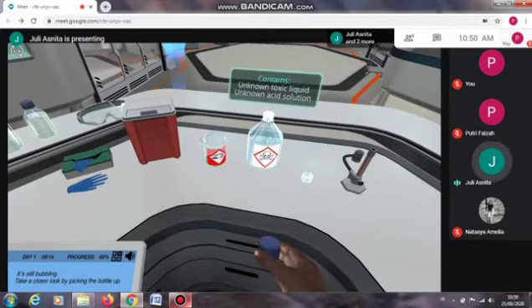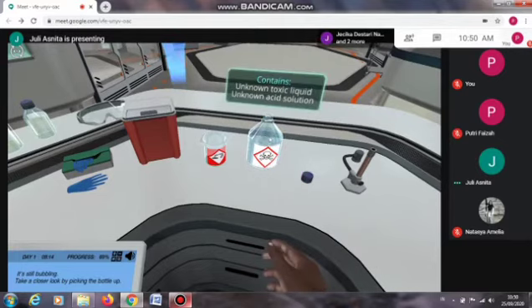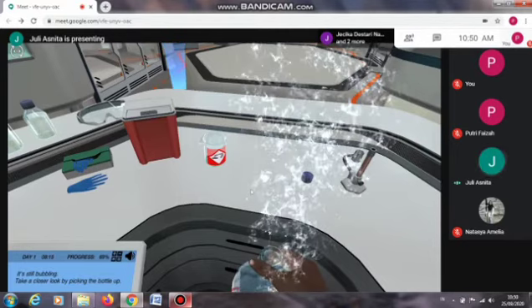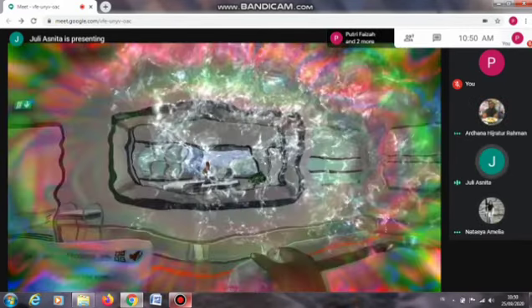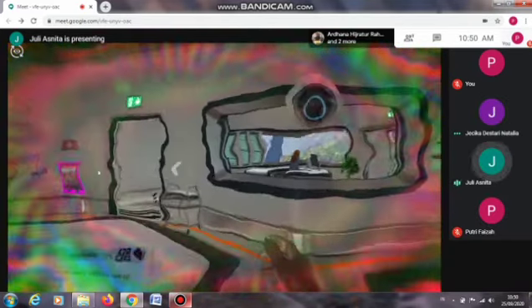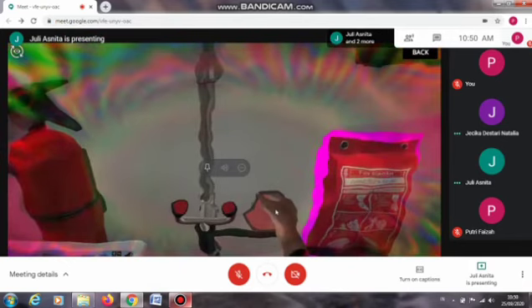We close it, but it won't close. Now we take the bottle. Oh no, you've got acid in your eyes. We must escape. Quickly go to the red safety station next to the emergency exit. Push the toggle at the safety station to rinse your eyes with water.